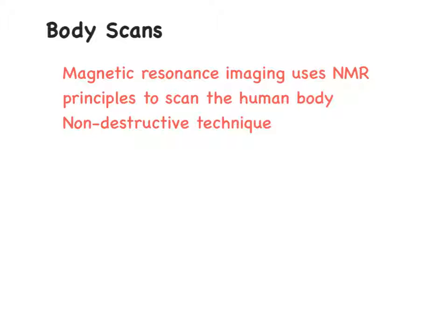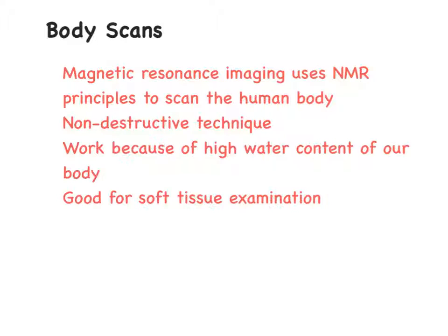A lot of the techniques we use in chemistry to analyse a sample, especially instrumental analysis, we actually destroy the sample. But we obviously don't want that. If you're going into hospital to have an MRI, magnetic resonance imaging, then we don't really want to lose part of our body or have it destroyed as we're having it tested. So it's very handy for us to do this.